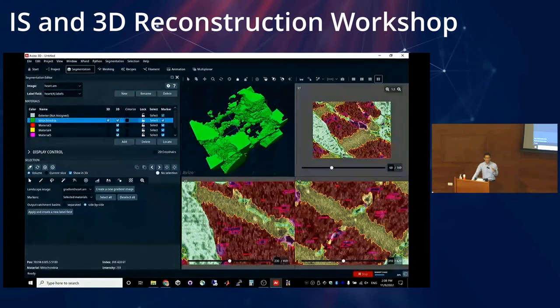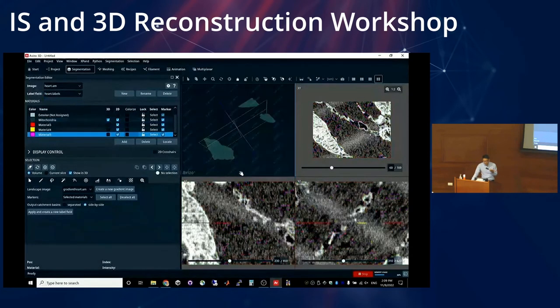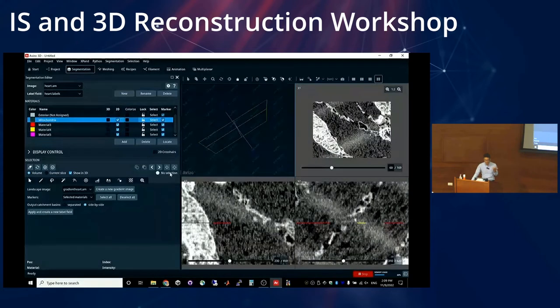It's fine, right? Actually, in a recent project that I was working on, I first did brushstrokes on the XY slice. That's kind of natural because your imaging usually does the images along XY. But you can actually brush on the other planes. And in some cases, in the example that I was working with today, that gave me, I don't know, two times much better results.